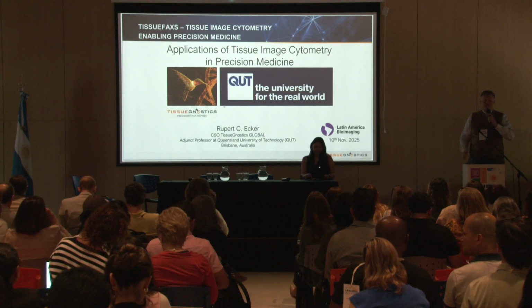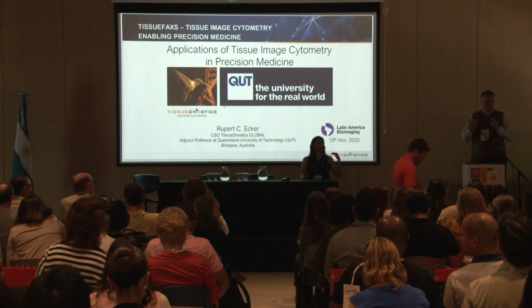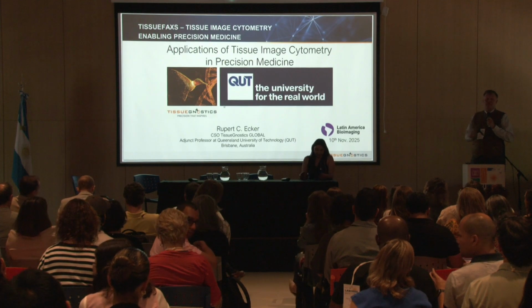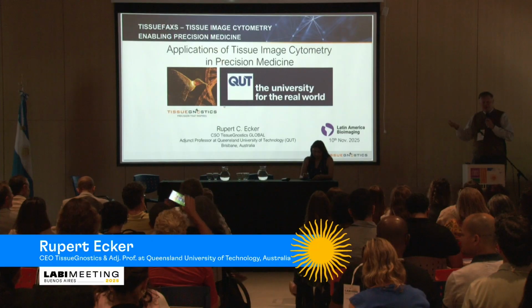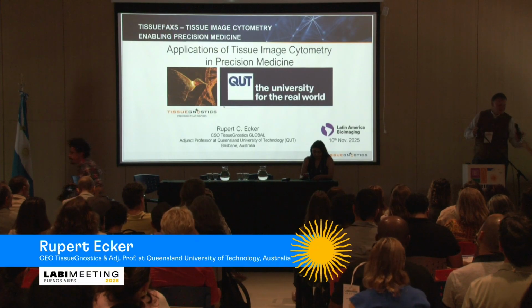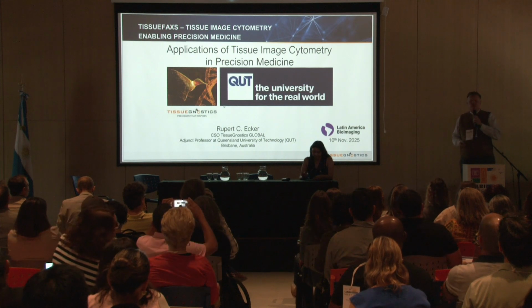Yeah, thank you very much for the kind introduction. It's my great pleasure to be here today in Buenos Aires and talk about my passion. My passion being bringing the idea of flow cytometry, which is quantitative analysis of antibody-mediated staining on the level of individual cells, bringing this idea from cell suspensions to the tissue section, the microscopic slide.